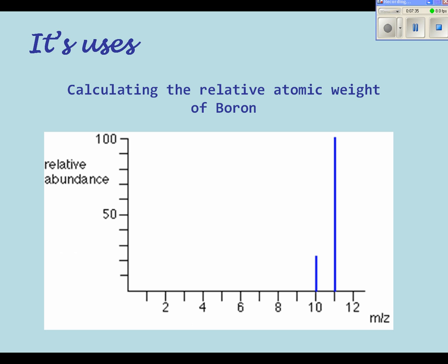So we end up with a series of charts, a bit like this one here, that show particles that have hit the screen at various magnetic field strengths. And in this diagram, this is a mass spectrum of boron. It shows that when boron passes into a mass spectrometer, that is boron the element, we end up with two regions, two spikes in the spectrum, which means there are two different particles within boron. So in fact, this is illustrating the use of the mass spectrometer to identify isotopes.